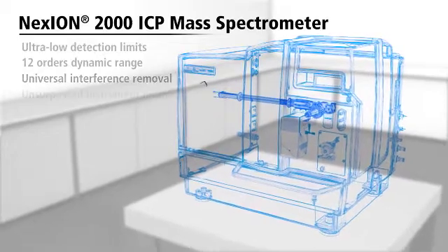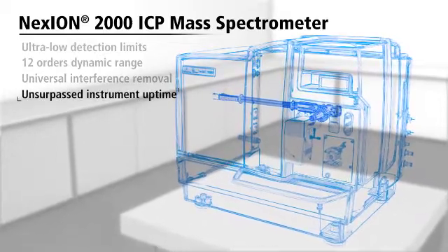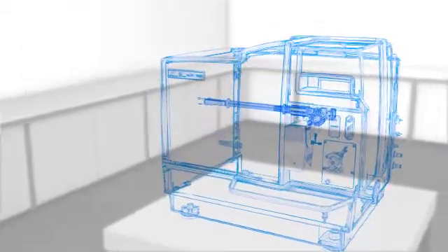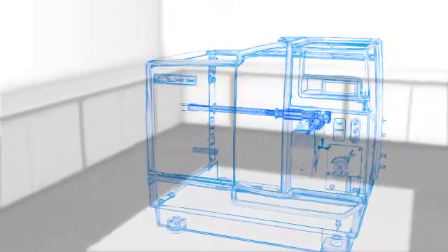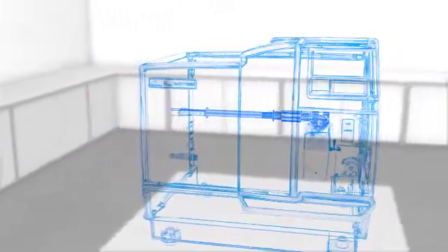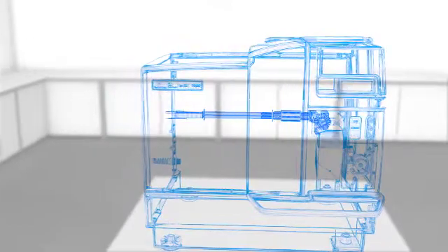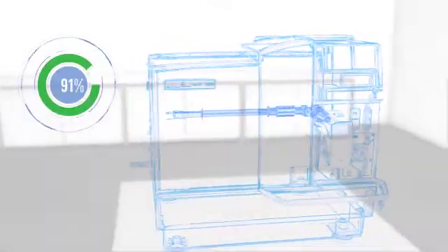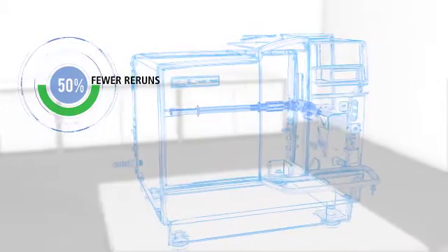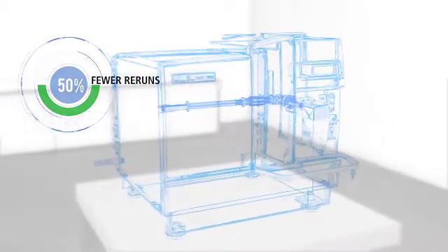It provides the most direct path to reproducible and accurate results. That path is further aided by the instrument's versatile dilution capabilities and its ability to selectively reduce the signal for any element of interest, thereby improving productivity and leading to up to 50% fewer reruns.